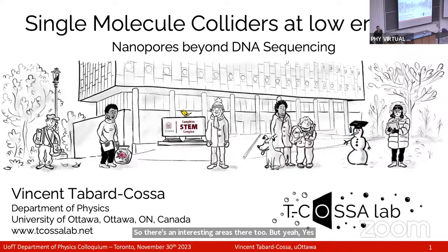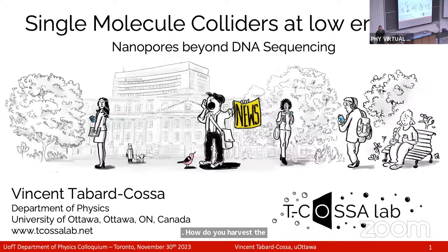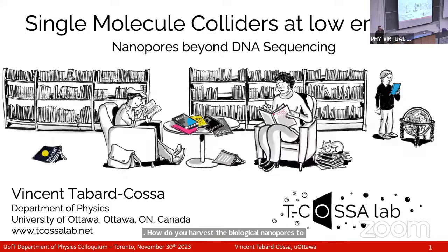How do you harvest the biological nanopores to integrate into your experiment? Yeah. So how do you harvest biological nanopores for experiments?